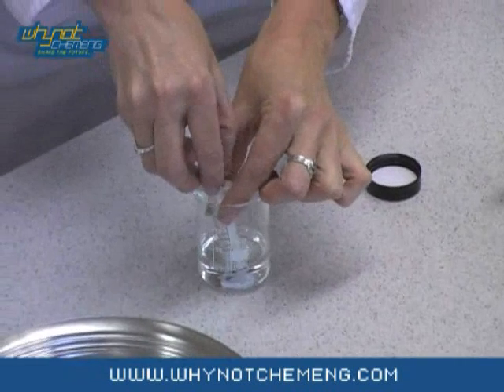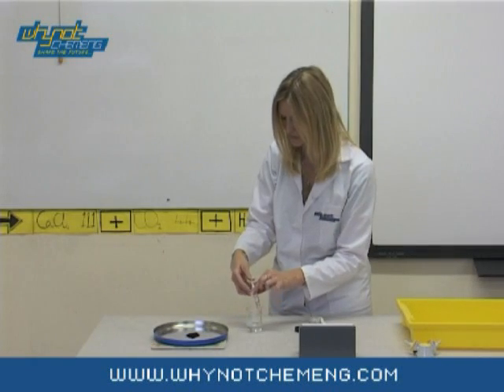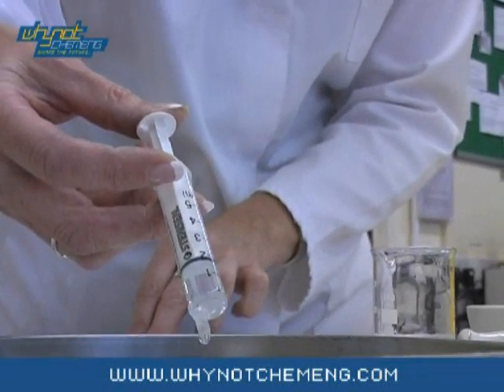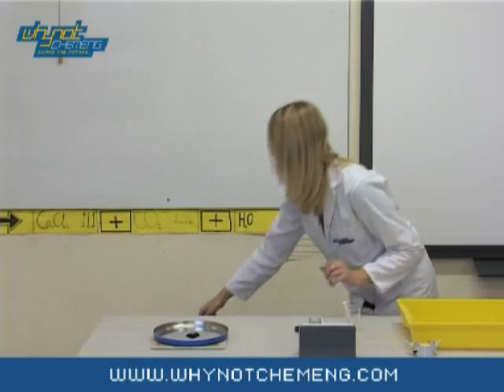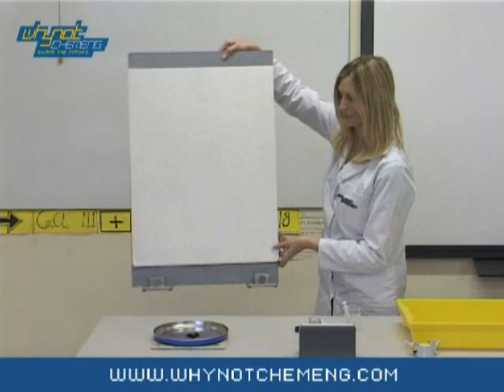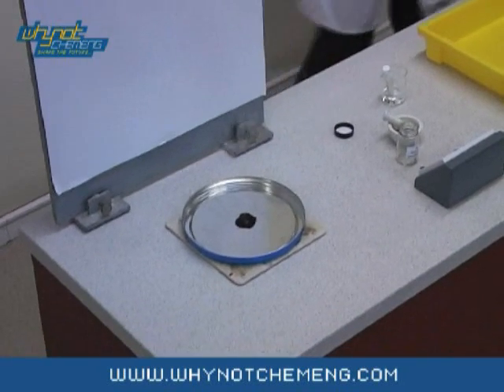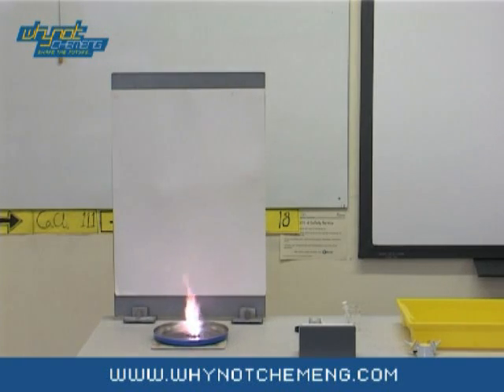The demonstration will take about 20 seconds for the potassium permanganate to oxidise the glycerol into carbon dioxide and water, and it then becomes reduced itself. This demonstration does look good if you can either black out the room or put a white background behind it. The lilac flame is characteristic of potassium salts.